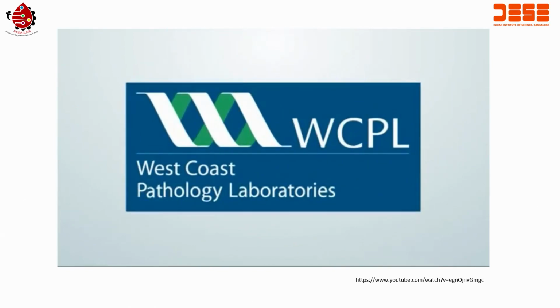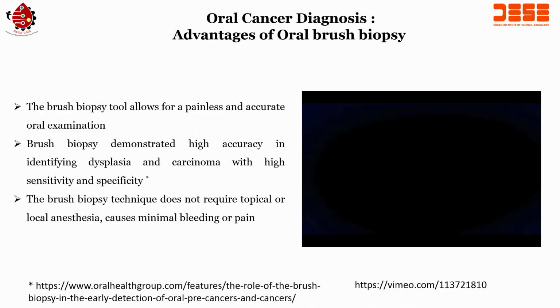Okay. So, you have seen that video, right. Now, what are the advantages of oral brush biopsy in oral cancer diagnostics. So, let us focus on this particular topic now, where we are considering the advantages of the brush biopsy. If you see the slide, the brush biopsy tool allows for painless and accurate oral examination. That is the first advantage, that it is painless and it is accurate.